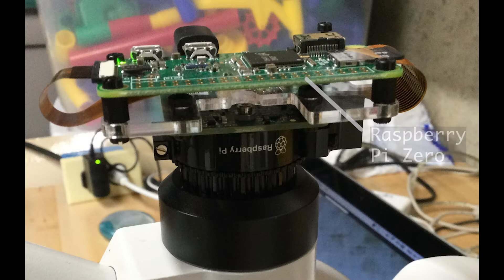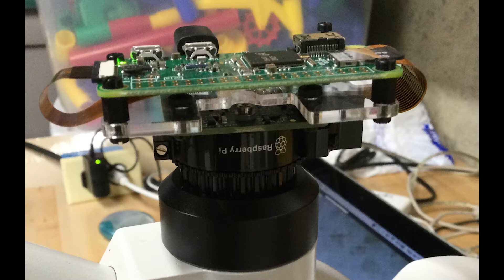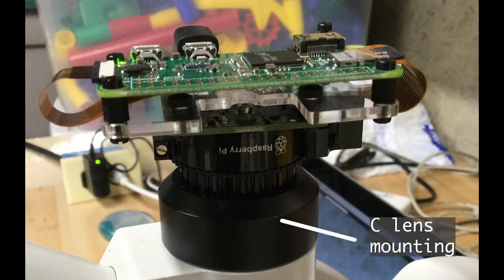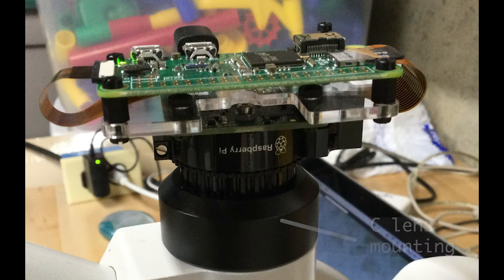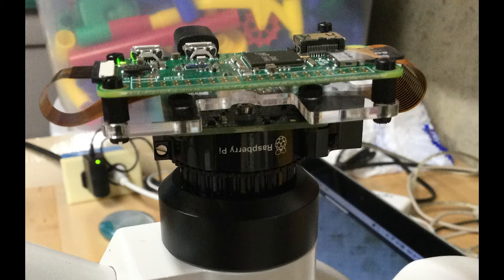Microscopes purchased with the option to fit a camera are equipped with a C lens mounting. The Raspberry Pi HQ camera module, which is purchased without a lens, will connect to a C lens mounting. That is why this setup works.